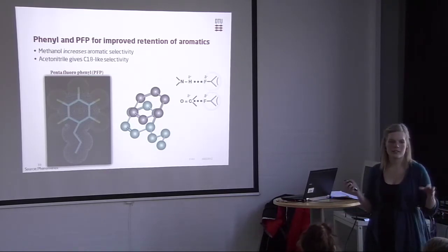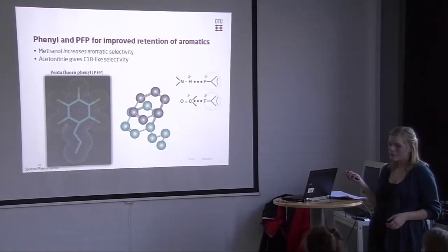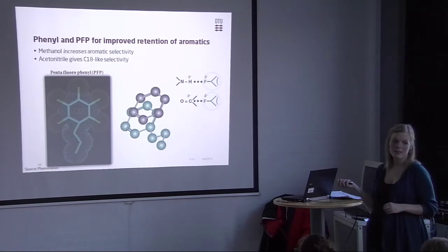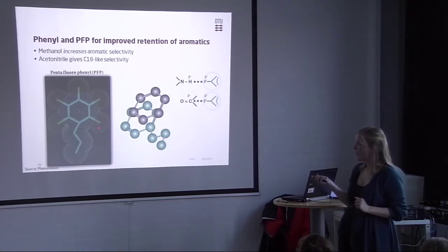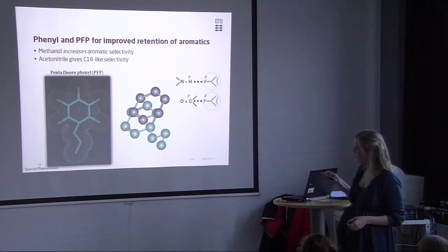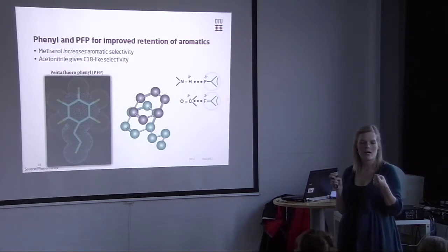Depending on what type of functionality that you have on your stationary phase, you change your selectivity. And phenyl and pentafluorophenyl are not just more polar, they also have other types of selectivities. And that is because of the benzene ring. So the benzene ring here can create these van der Waals forces that we talked about last time. You had a molecule, morphine, I think it was. So you got kind of a dipole here that will attract other aromatic molecules. So here you got the stationary phase with an analyte aromatic ring sitting on top. So that will hold on to aromatic compounds even harder.